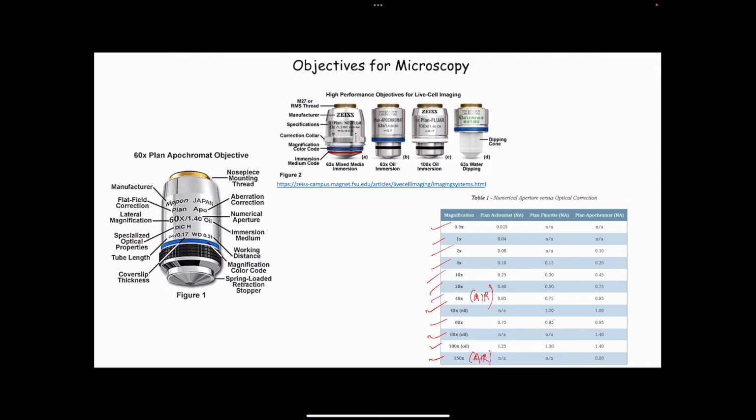But all of these are available commercially from different microscope companies, and you have to know that all of these do not make sense by themselves. They only make sense in combination with certain chromatic aberration corrections, which is very important to visualize your sample with the objective that you are choosing. So when you're buying or using any objective, you must know what different kinds of aberrations there are and how the different types of corrections are done, in the form of flat field correction, in terms of achromat, whether it's apochromat, whether it's fluorite correction, and all those things. All of these things eventually matter when you come down to your resolution.